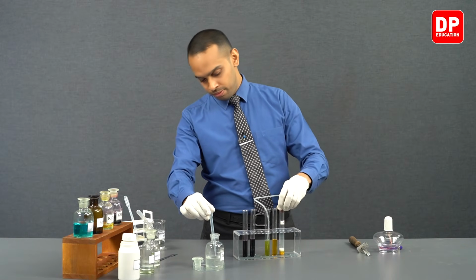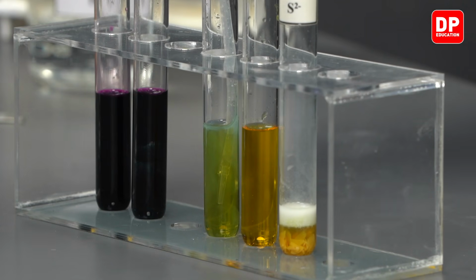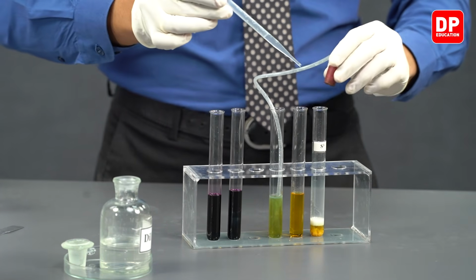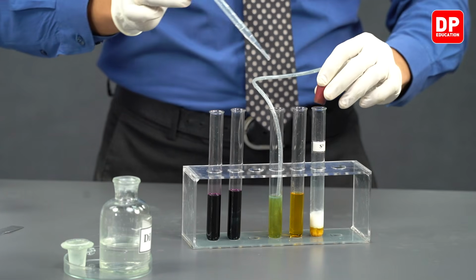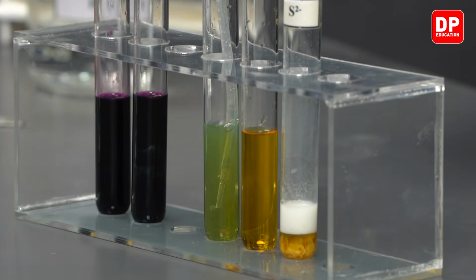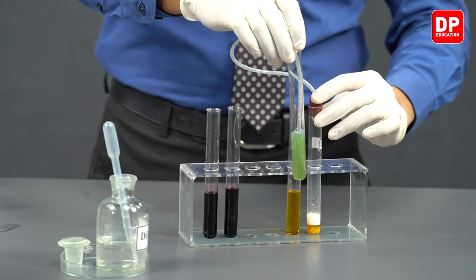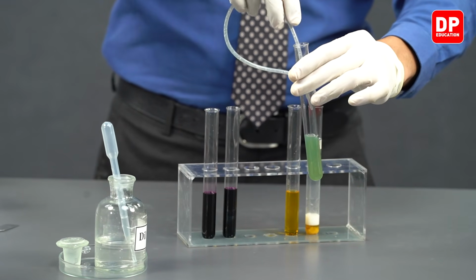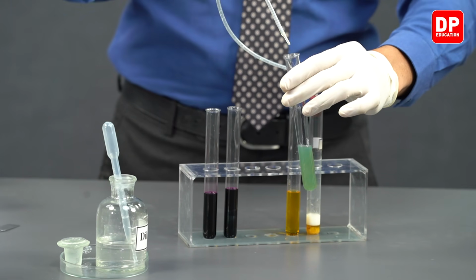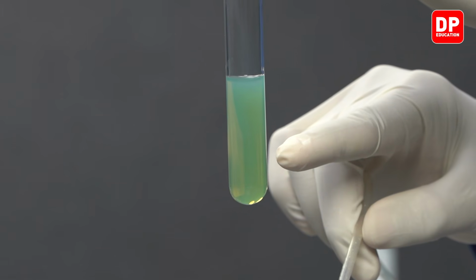You can observe the color is changing in the acidified potassium dichromate solution. Can you observe that as the color turned to a green color, the solution became unclear?